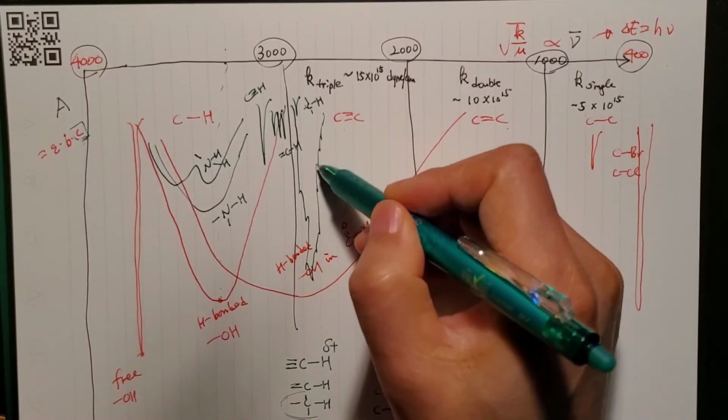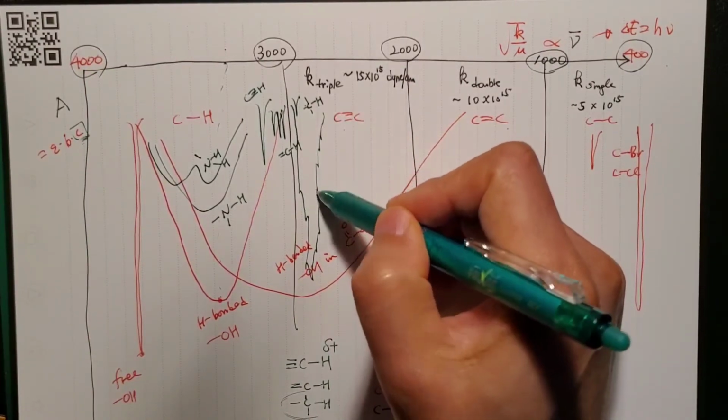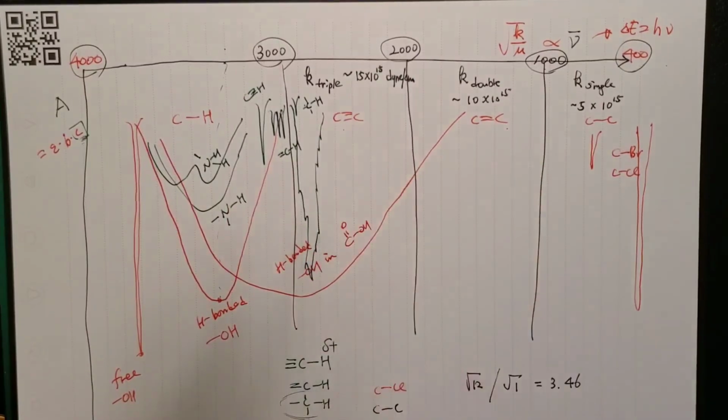And then all these little spikes indicate the modes of stretching coming from the CH2s. So there are a lot of different CH2s included in this peak.